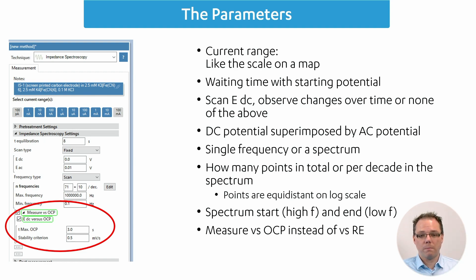The open circuit potential will be measured right before the measurement and it will be assumed that it doesn't change throughout the measurement. You can set here how long you want to measure the OCP before you start, or which stability criterion needs to be met before the measurement will start.